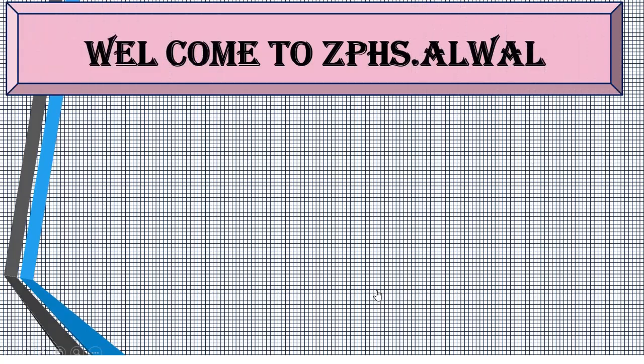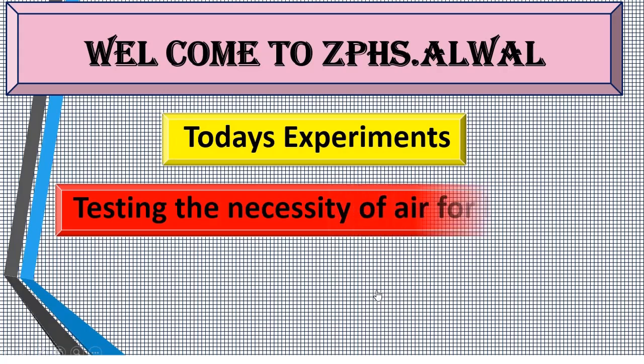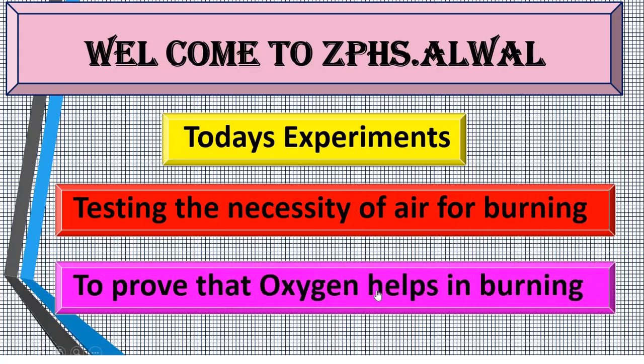Welcome to ZPHS Alwal. Today's experiment is testing the necessity of air for burning, to prove that oxygen helps in burning.